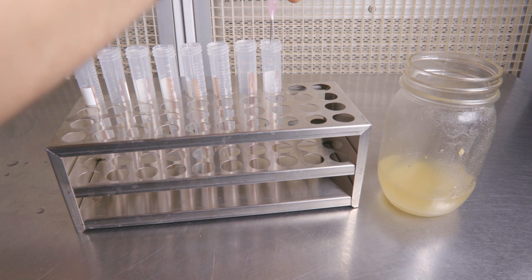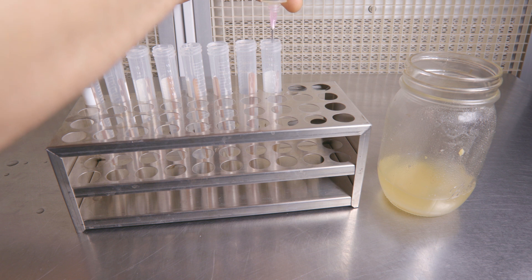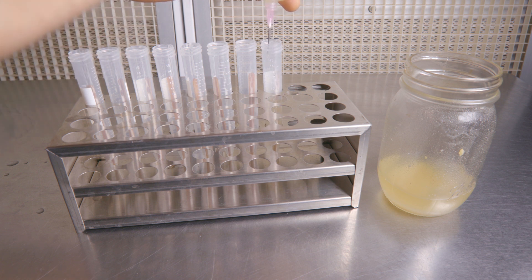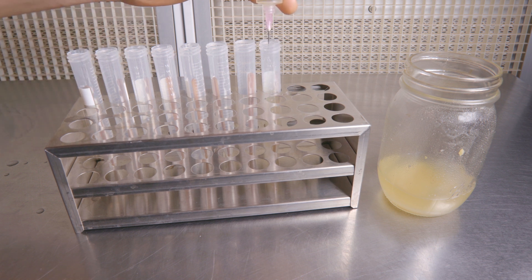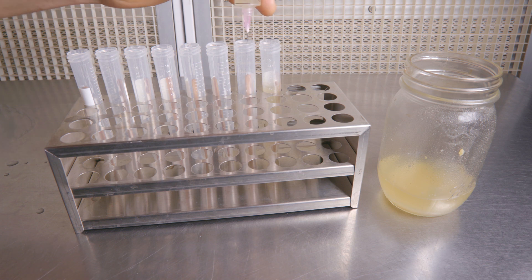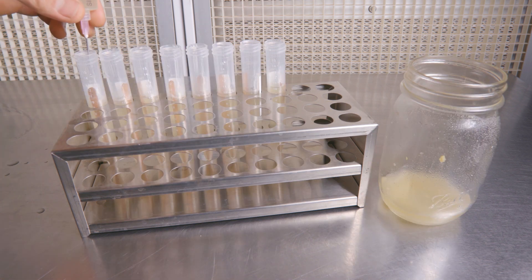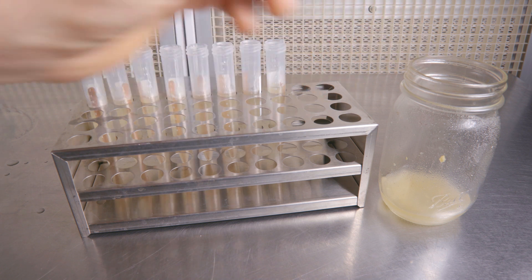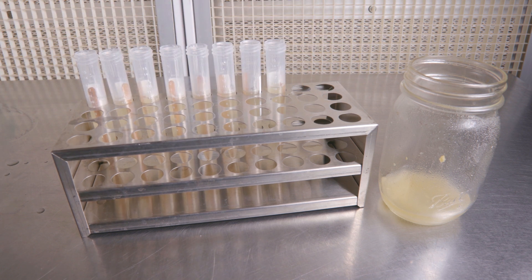These particular slants are 15 milliliters. I like to add 10 milliliters of solution to each slant. That way I have a nice slope to work with after these cool. If you're using a different slant size, simply fill your tube with water and begin to pour it out until you reach the slope of your preference. Then simply fill each one of your slants with that amount of solution.